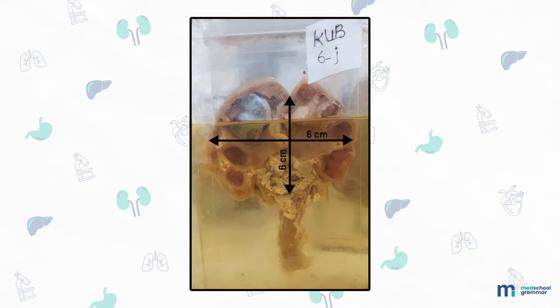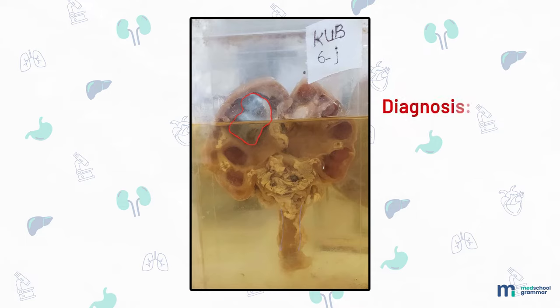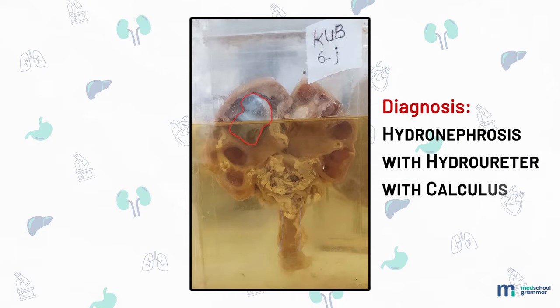Specimen of kidney with 5 centimeter length of ureter. Kidney is 6 by 5 by 2 centimeter. External surface nodular. Cut surface shows markedly dilated pelvicalyceal system, large calculus seen, ureter dilated. Diagnosis: hydronephrosis with hydroureter with calculus.